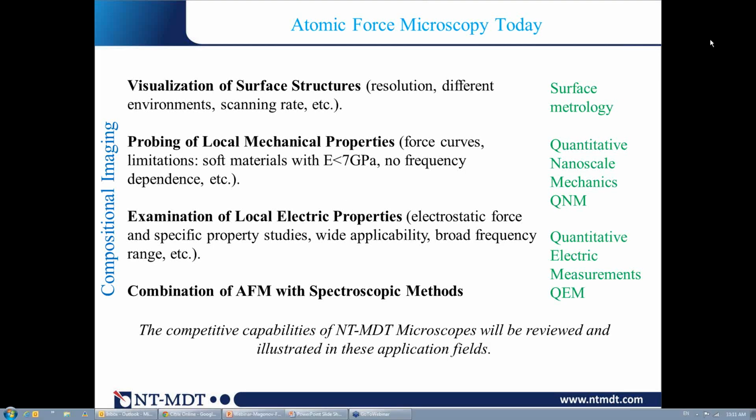And in each field, besides getting information, like images or data related to mechanics or electric properties, people are always thinking about how precisely we do that, because now with the shrinkage of dimensions of functional structures and also devices, people are more and more interested in quantitative measurements of material properties on small scales.